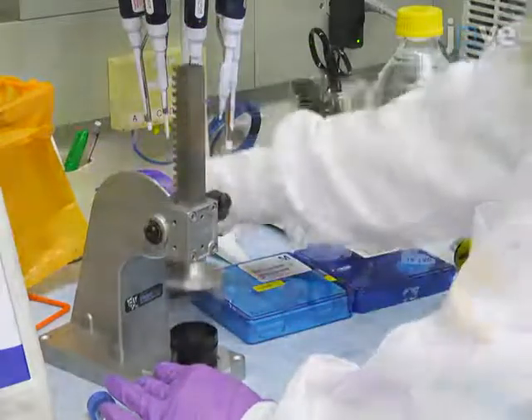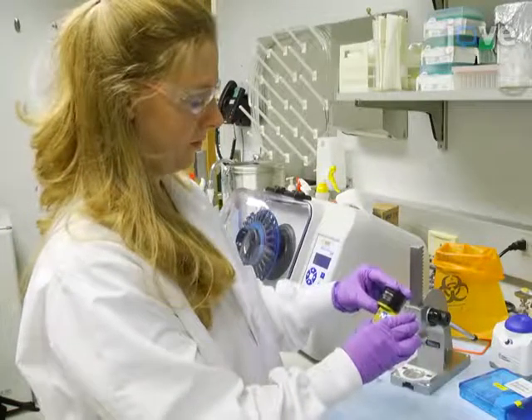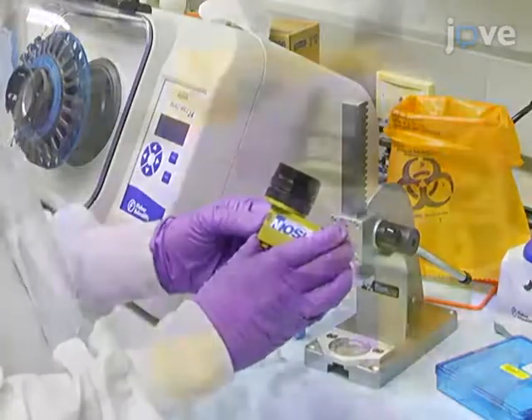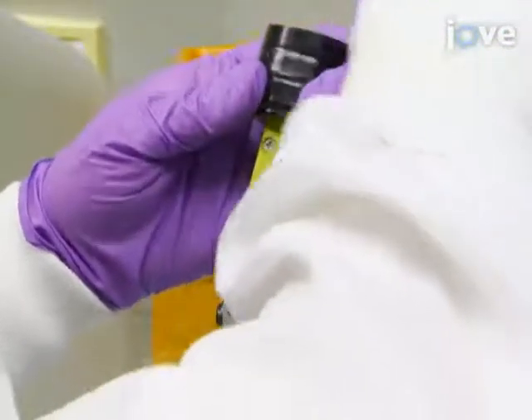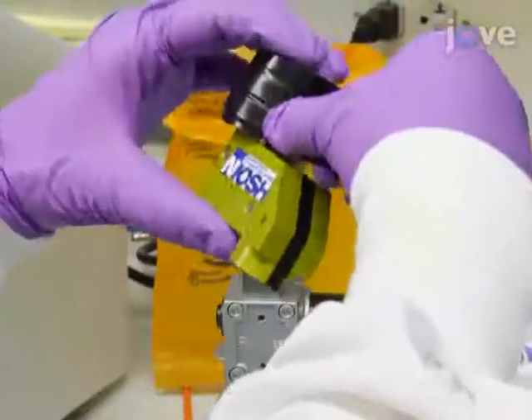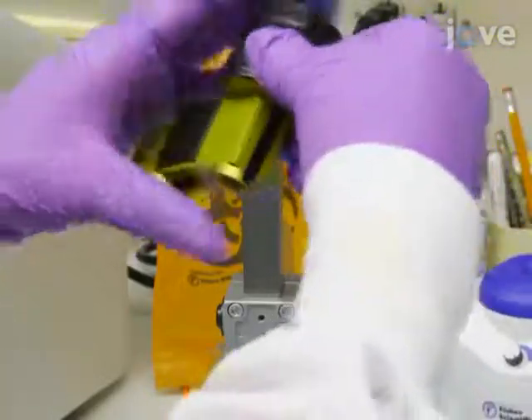Then, fit the assembled cassette on top of the NIOSH aerosol sampler and push down as much as possible. Use a piece of 19mm tape to wrap around the outside of the filter cassette and sampler, holding the filter cassette in place and acting as a backup seal to prevent leaks.